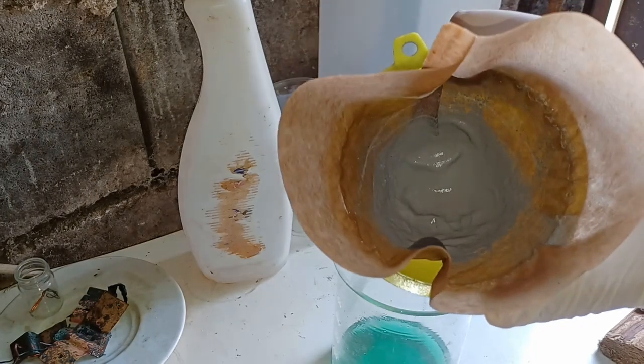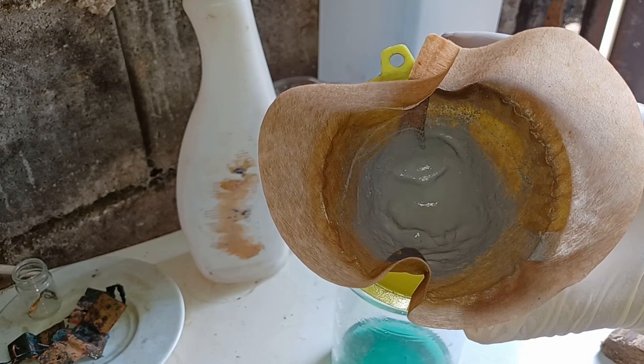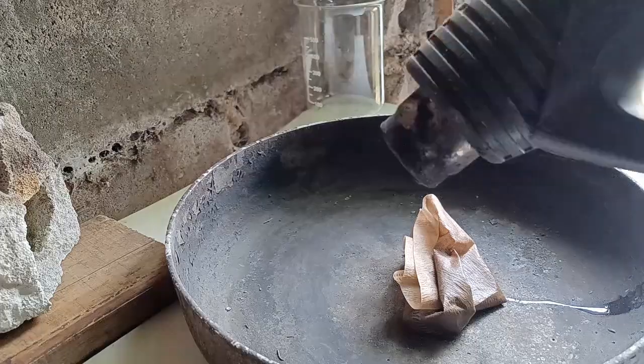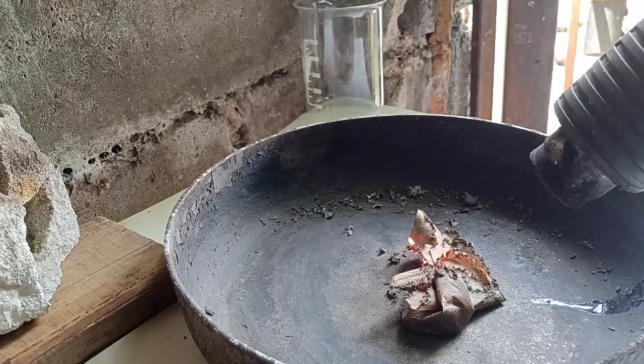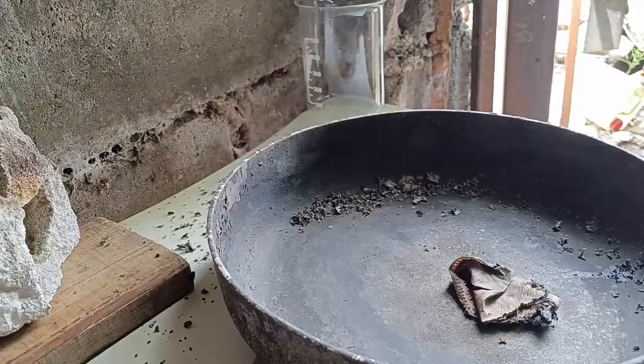To separate the ceramic dust from silver, I had to smelt it with a flux. I used a mix of washing soda, borax, and crushed glass. But before that, I dried the filter paper to save on gas.